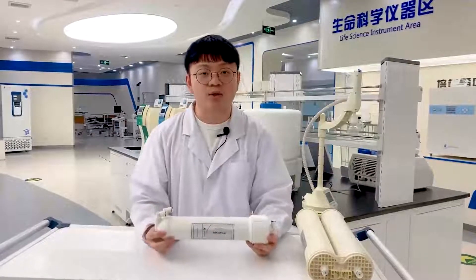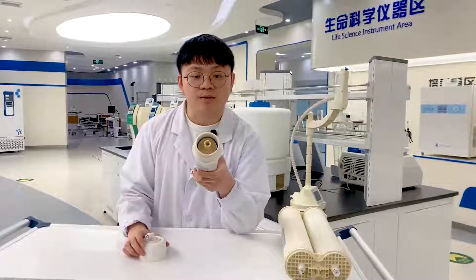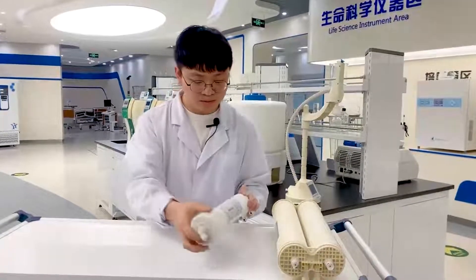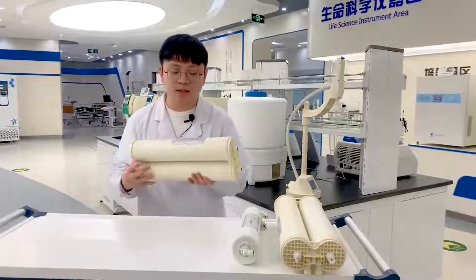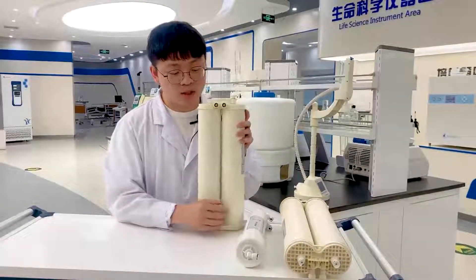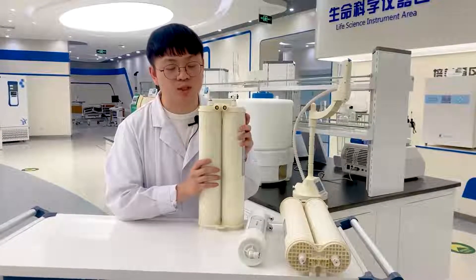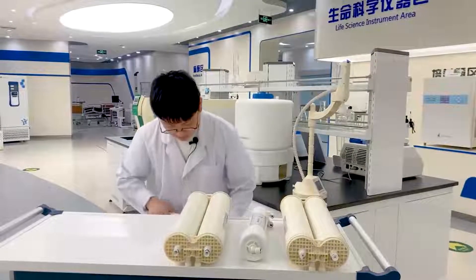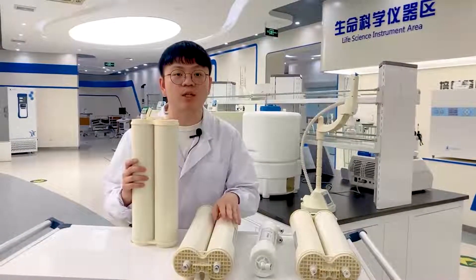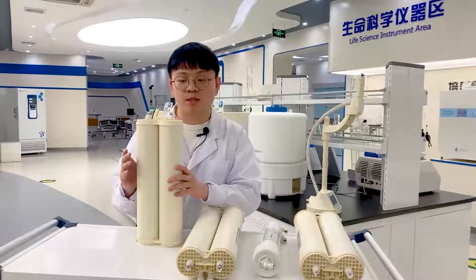This is our RO module. We use DOW high-quality membrane systems. Once the water comes through the RO module, it will come to our purification cartridge and become Type 2 water. When the Type 2 water comes through the ultra-purification cartridge, it becomes Type 1 water.